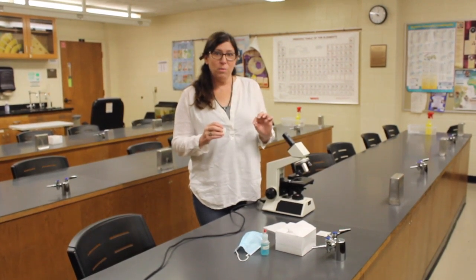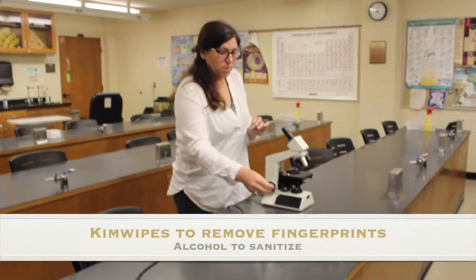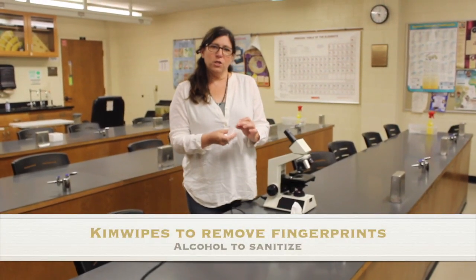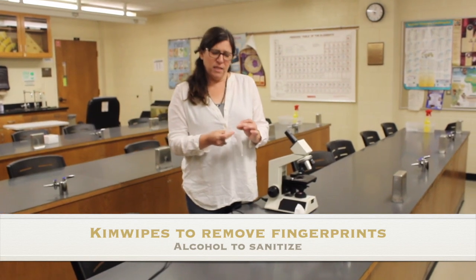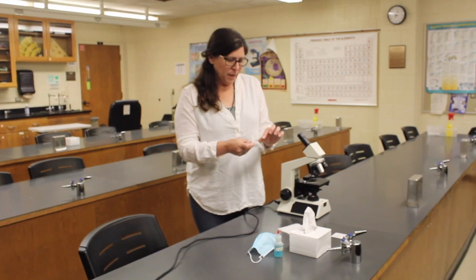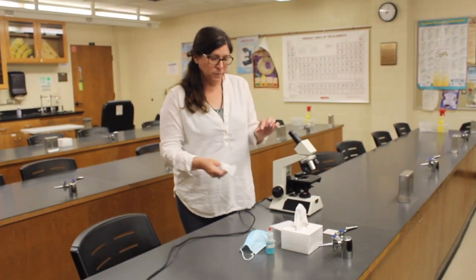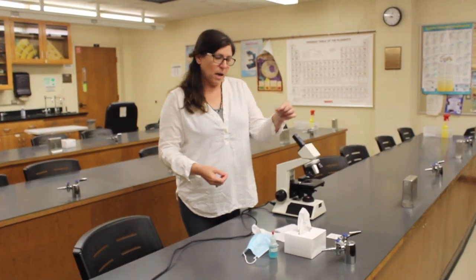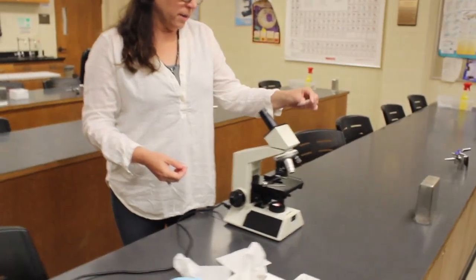We usually start learning how to use a microscope using the letter E. We want to clean the slide before we put it on our microscope. There's a box of Kim wipes available, and you're just going to take one and go in a circular motion. Make sure it's nice and clean and has no fingerprints on there. If we're being very careful, we can also clean these with alcohol. The next thing that we're going to do is seat the slide on the microscope, and we're going to put it on the stage.